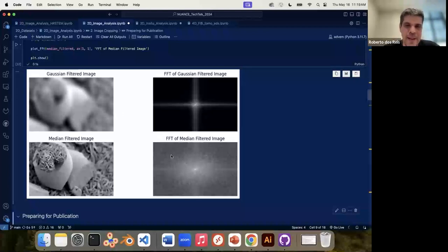So you don't have that, quote unquote, scattering function here all the way to the end, right? So it's kind of like cropping some of that, so you lose resolution. The same way, if you're familiar with electron diffraction, you take a diffraction pattern and measure the resolution of your microscope using it. It's similar here.